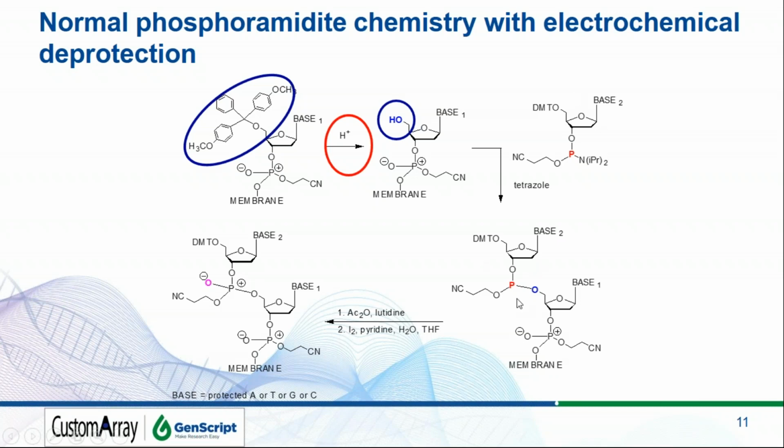You see there, that's a trivalent phosphite. That's not a stable arrangement. So the next couple chemical steps basically are just going to fine tune that, and you end up with a pentavalent phosphate. And now this looks more like what you want to see. You repeat these steps over and over again to make the oligo. It's a very cyclical process. We basically talk always in cycles when we're talking about DNA synthesis.